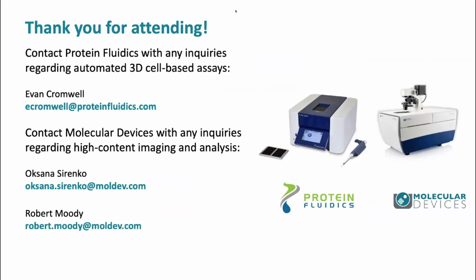About analysis, this is a very interesting question, because different customers may use different imaging instruments for capturing the complexity of biology. You can do something as simple as live/dead imaging, cell counts or cell scoring, and characterization of cells for different markers, for example to define apoptotic cells or cells positive for calcein AM or for mitochondria. But you can also do more sophisticated analysis where you count cells within other objects.